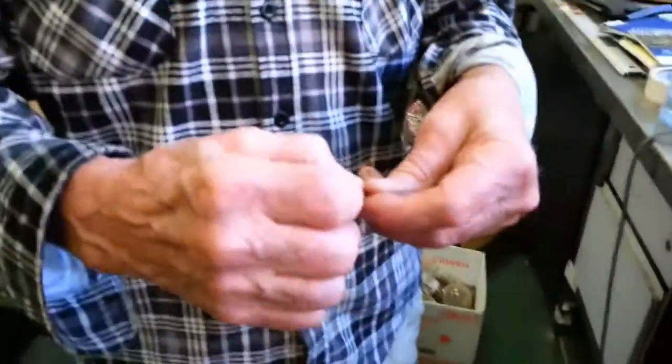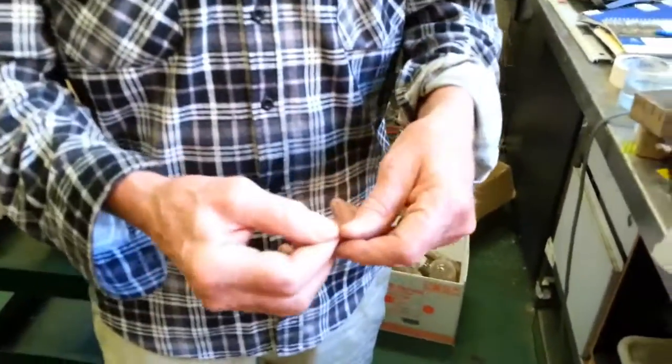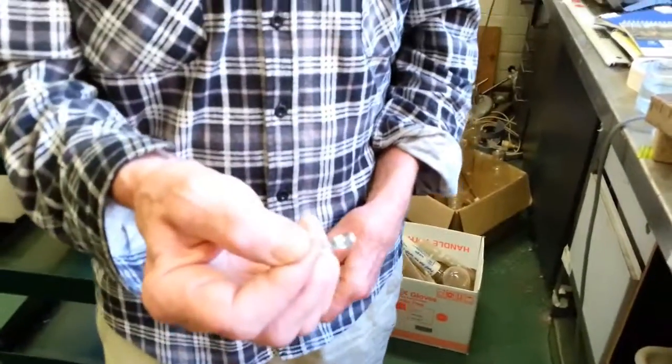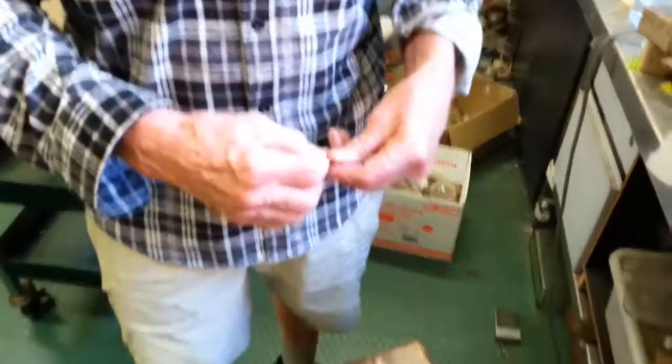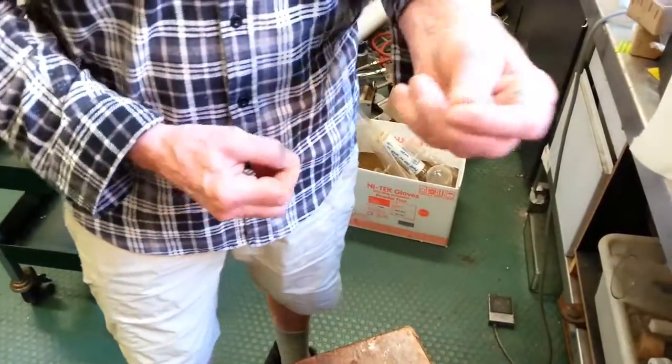When this breaks, it breaks into not pieces of glass that big, it breaks down into sand. Would you like to break it? It hurts a little bit. I'll break it for the camera. Alright. Let's make sure I've got... I'm going to wrap my fingers around it. Because otherwise it's going to fly all over the place. So that's broken.